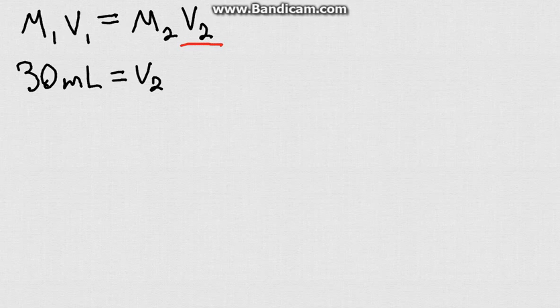We're going to want a 30 milliliter solution of 1.5 molar solution. It doesn't really matter what solution it is. So this is going to be our end result. So we want this to be M2.